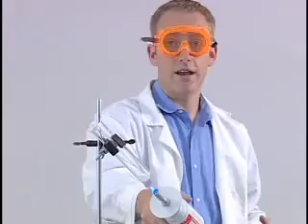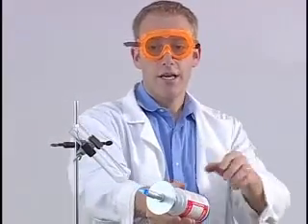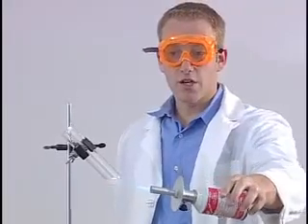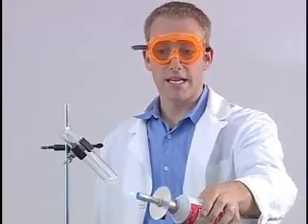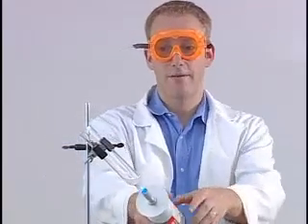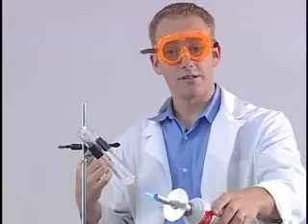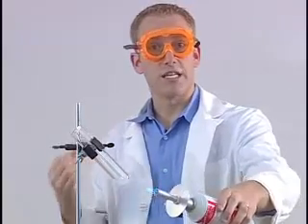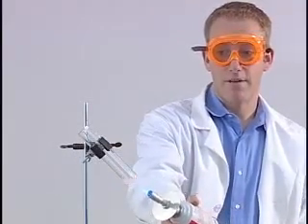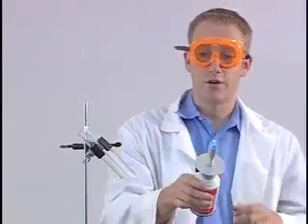And the reason I'm heating it in all different directions right now is because I want to make sure that I evenly heat the liquid so that one part isn't getting heated more than another, and the test tube shouldn't be that hot either, or else we can get some really dangerous problems in this lab. And notice I'm wearing my goggles and my lab coat, just like you need to do in any lab. Safety procedure, obviously, make sure you wear your goggles and an apron if need be. And in this case, you do.